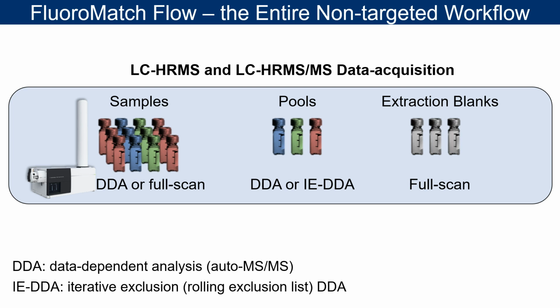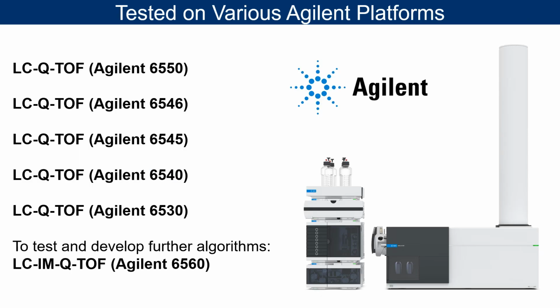It does not currently support all ions. And all you need is the .d files for Agilent, for example.